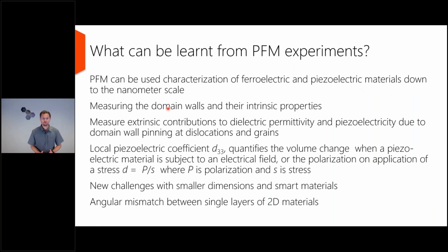What can be learned from a PFM experiment? It's used for the characterization of ferroelectric or piezoelectric materials down to the nanometer scale, so well below the micrometers. Laterally, that is the resolution, but vertically, we even go well below that.